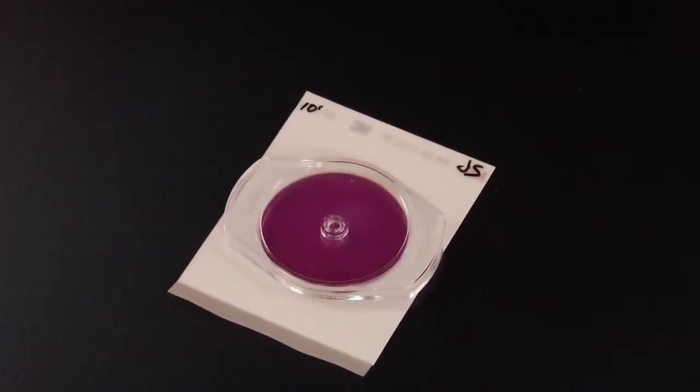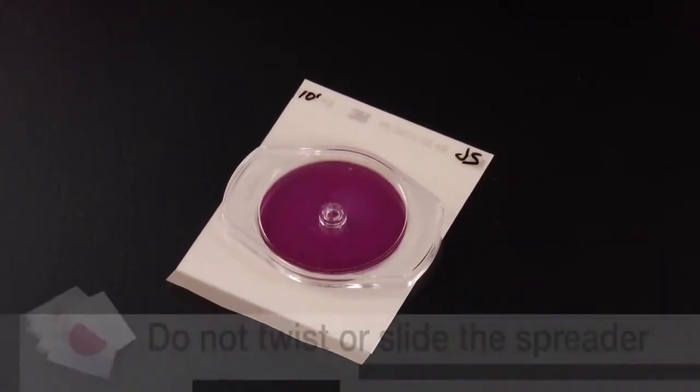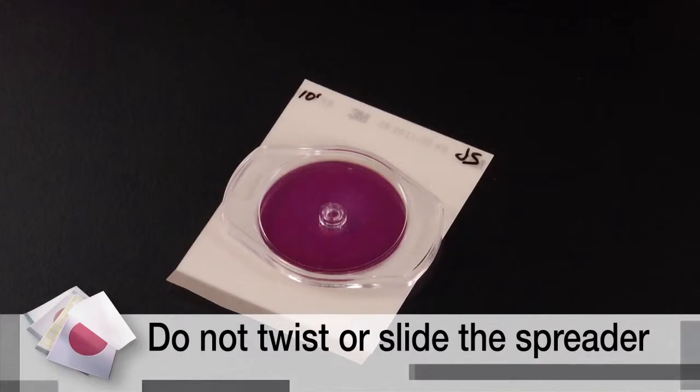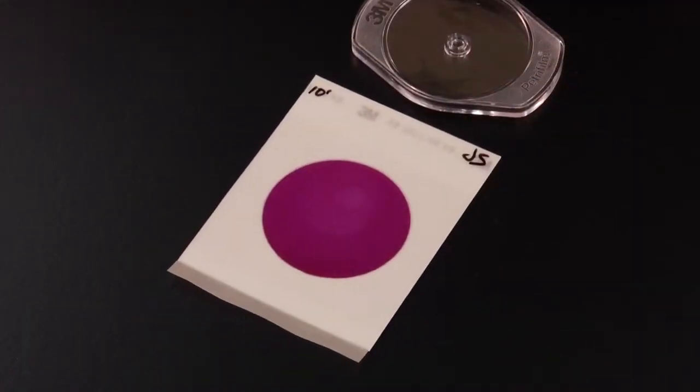Then gently apply pressure on the center of the spreader to distribute the inoculum over the entire circular area. Do not twist or slide the spreader. Lift the spreader and allow 1 minute for the gel to form.